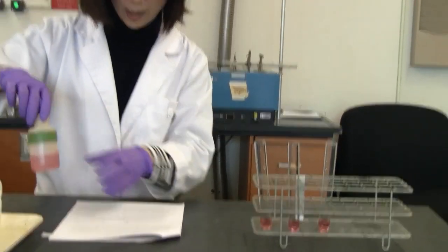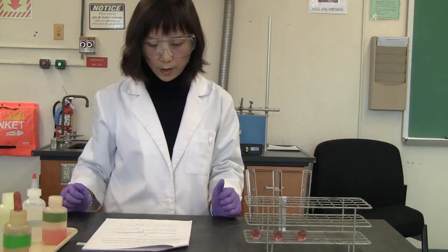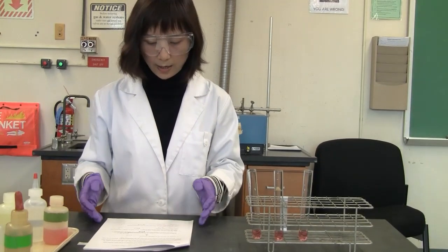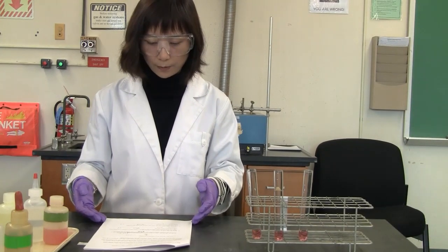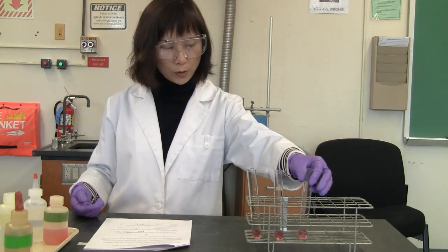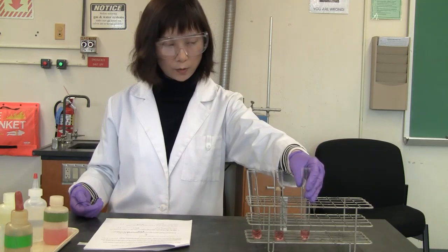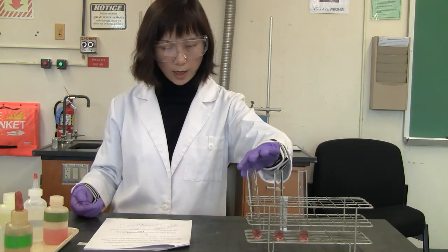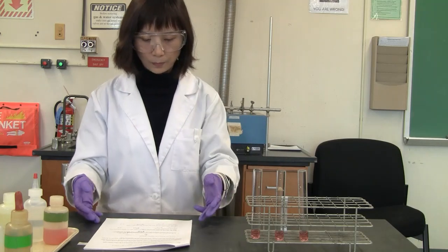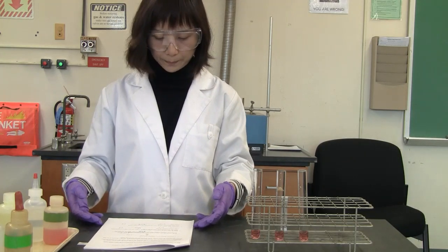Now you're going to see the color, okay? This is the source of the CoH2O6 ion in the reaction above. All right, we are going to use this test tube as the control. So you can see this is the original color. So anything changed, you can judge based on that. Okay, so now go to step 1.